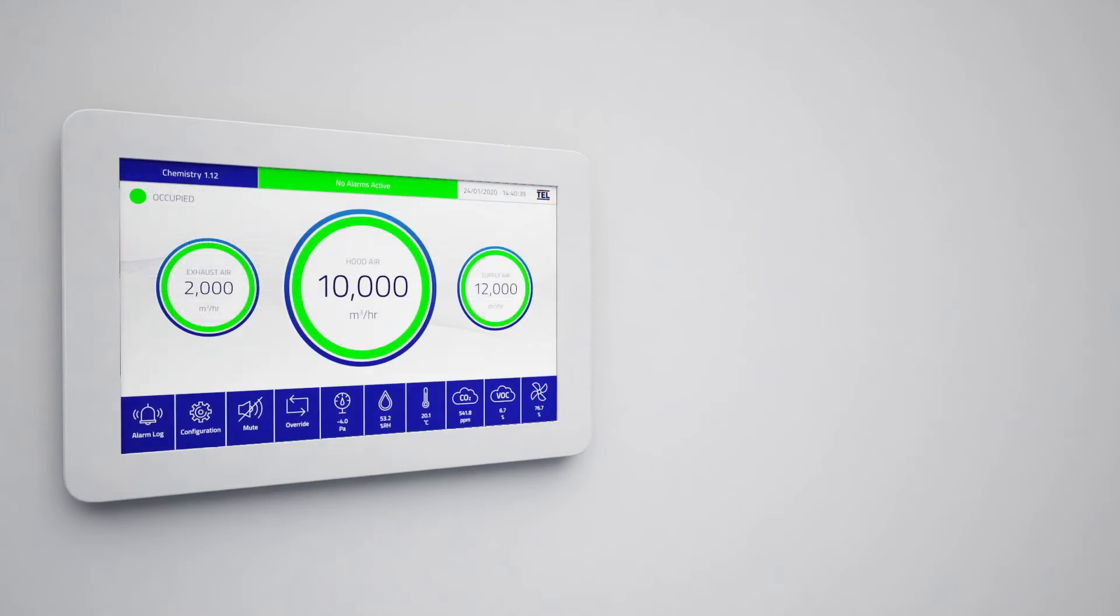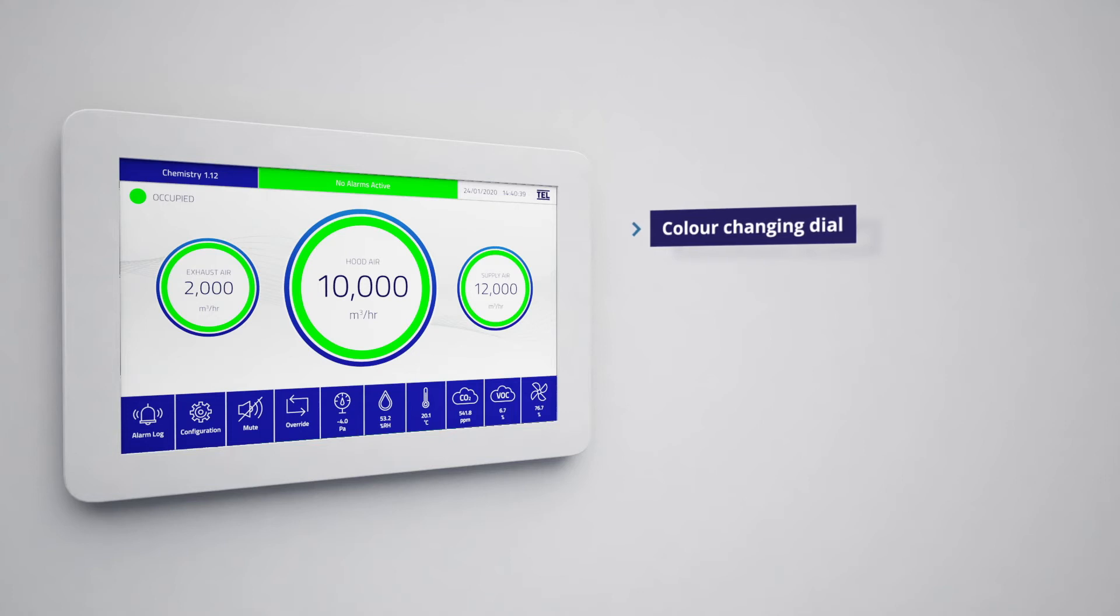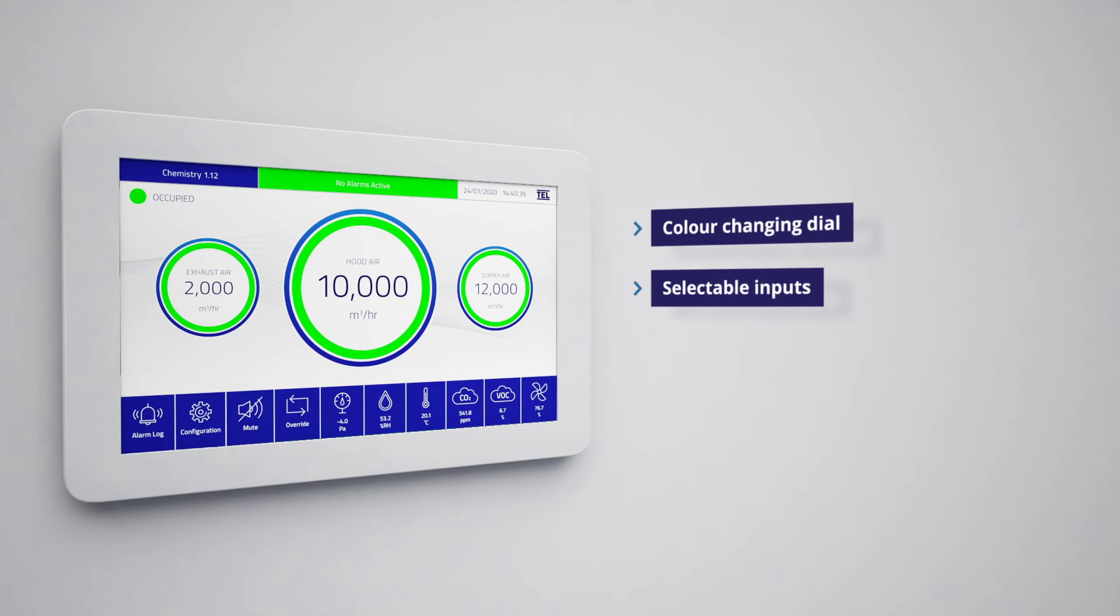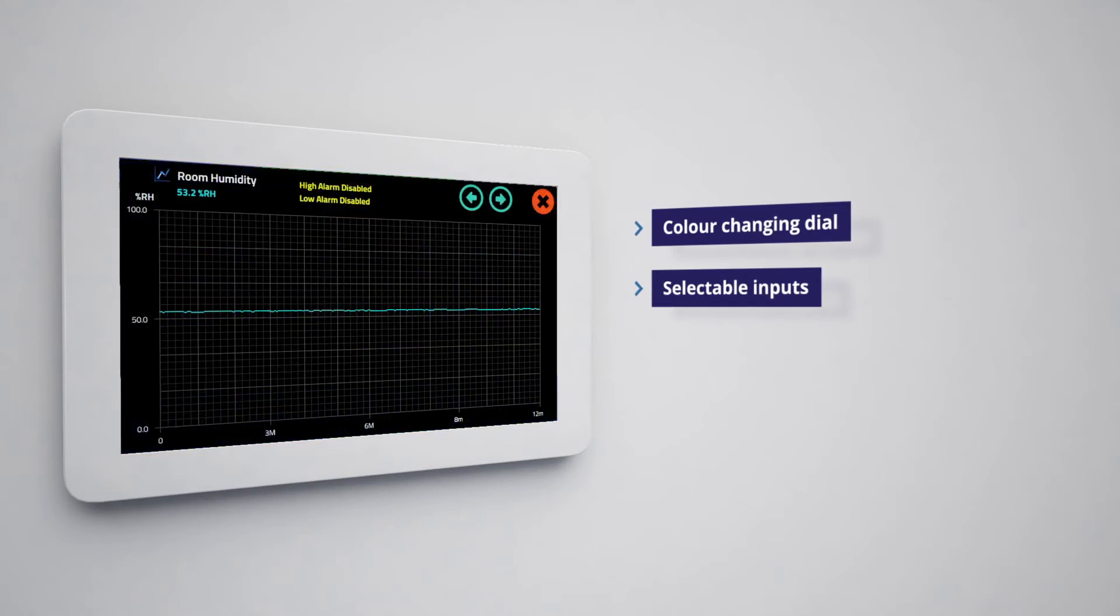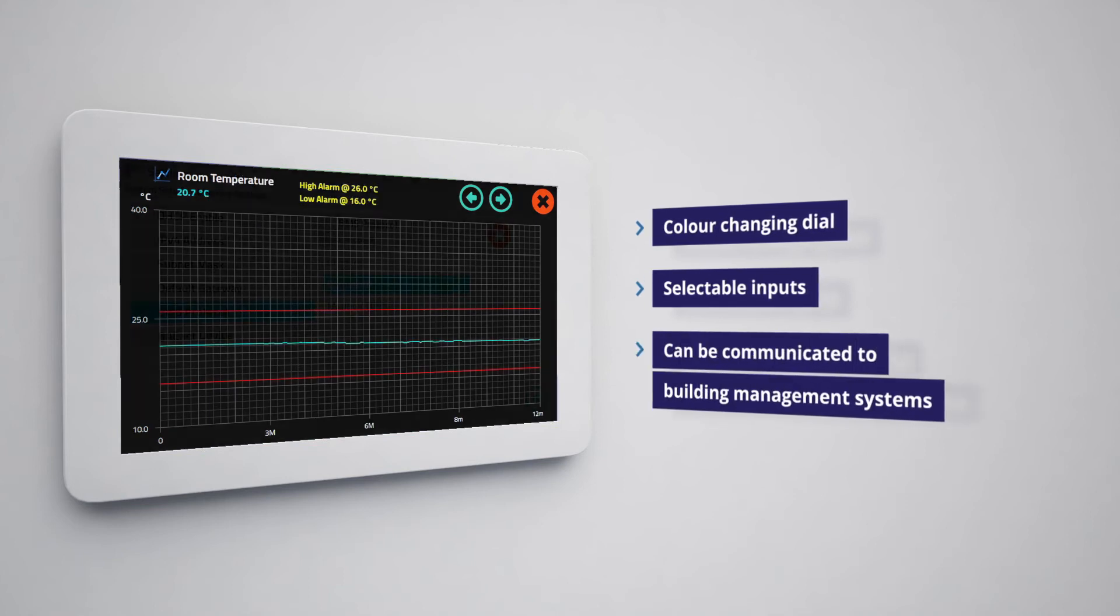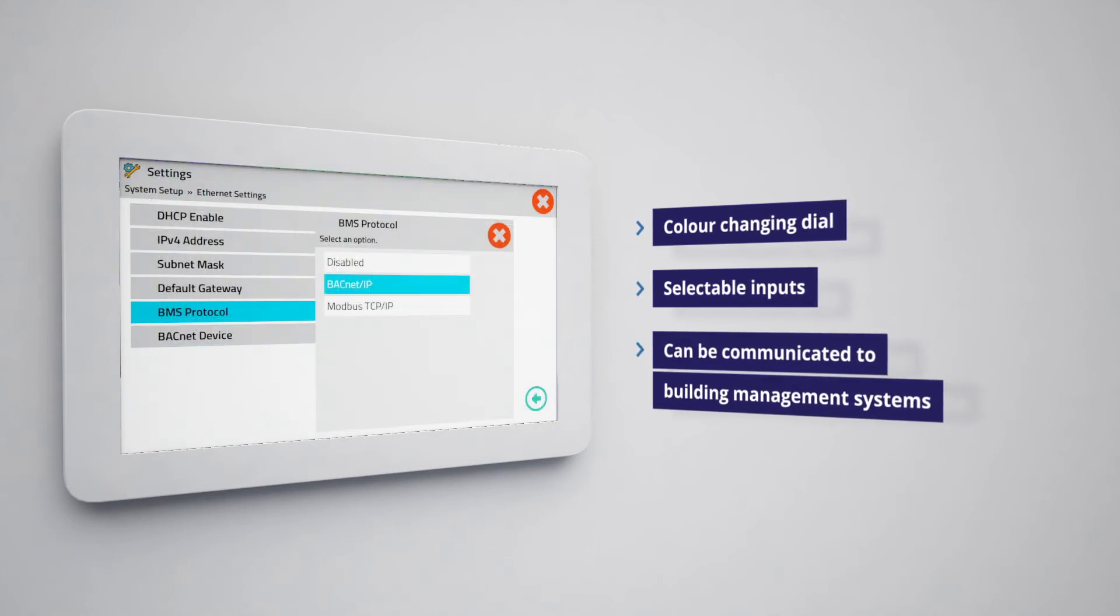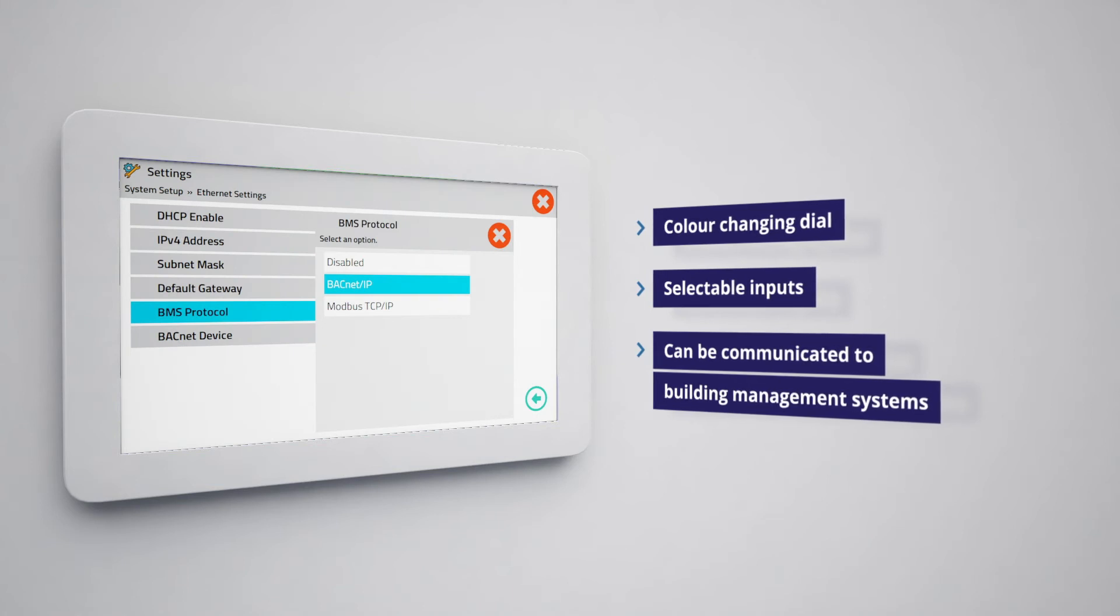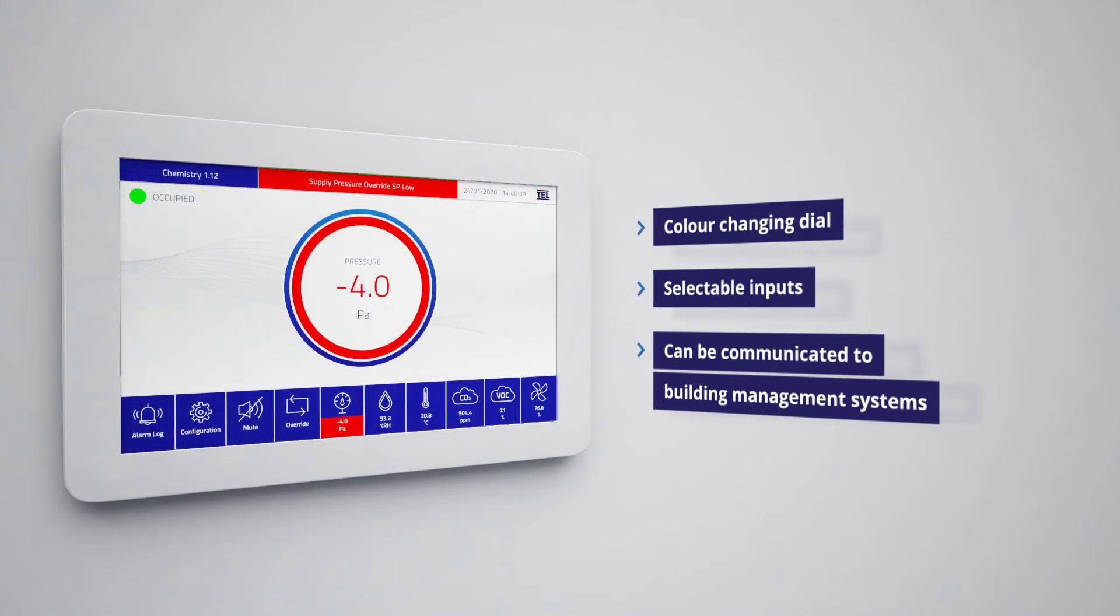In volumetric mode, the central colour changing dial indicates total fume hood air usage for up to 64 fume hoods per room and there are also selectable inputs for pressure, humidity, temperature, CO2 levels, VOC levels and room diversity. Each parameter is trended locally on the display and can be communicated to building management systems via ethernet protocols.